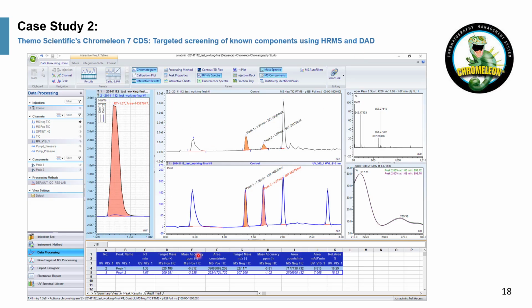Shown here is the ability to automatically annotate and get some of the data, but not all the functionality of the Exactive Orbitrap.